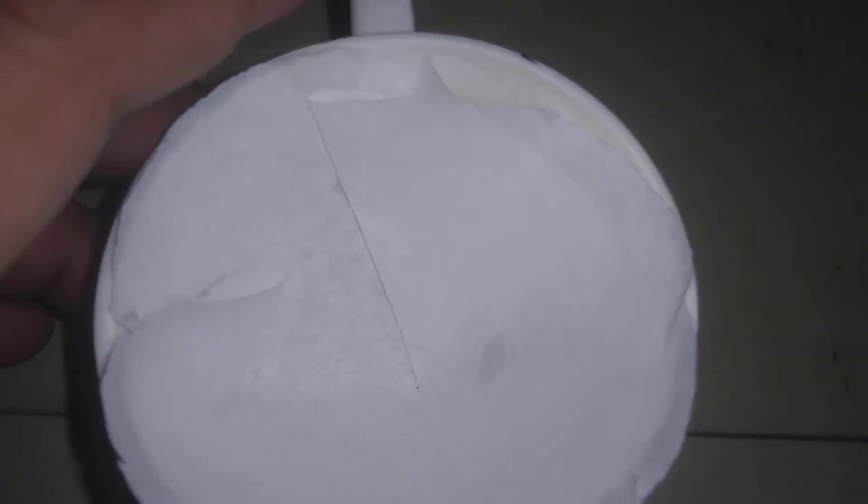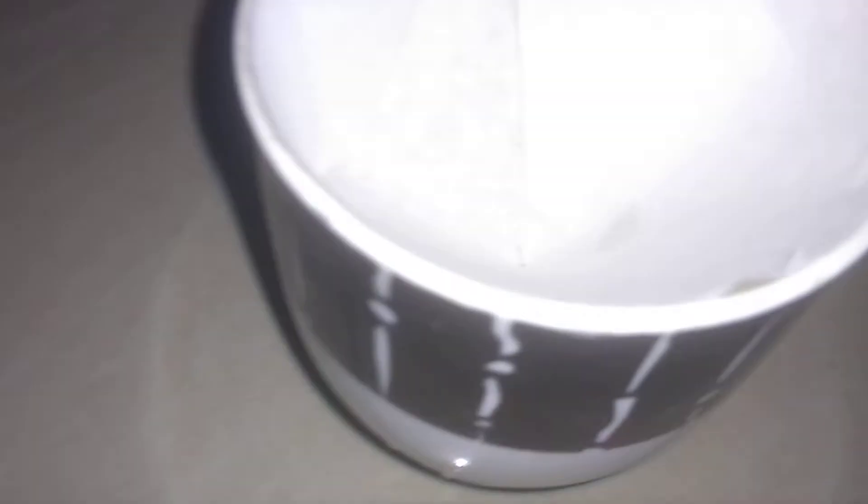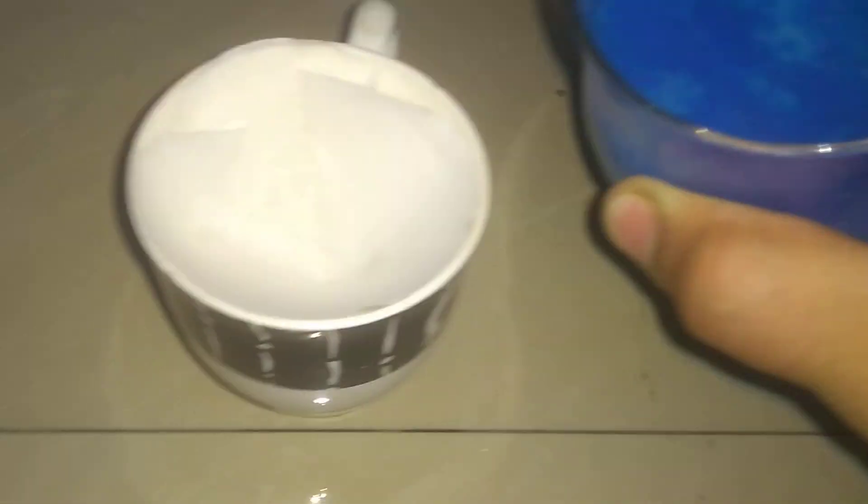Now what we're going to do is filter this precipitate, and that will be our pure copper hydroxide. I've got a filter paper right here — it's a cup and I've applied it onto it because I don't have a funnel right now, but I think that should work. Here's the copper hydroxide plus sodium sulfate mixture — actually a mixture, not a solution, because it's not homogeneous.